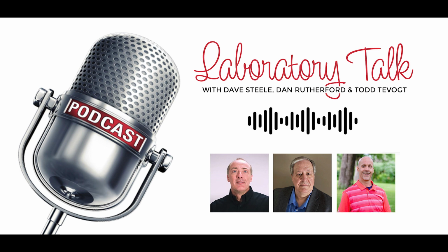In upcoming podcasts, we'll be getting into the detail of all sorts of vacuum technology related topics, including how various vacuum measurement units work and different types of pump technologies. And we'll cover practical subjects like best practices for operating different types of pumps and pipework used to connect vacuum systems together, and how these will impact the overall performance of your system.